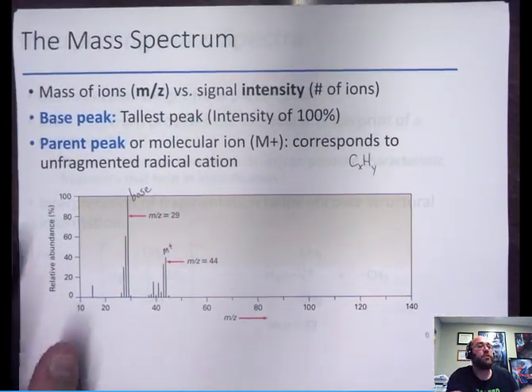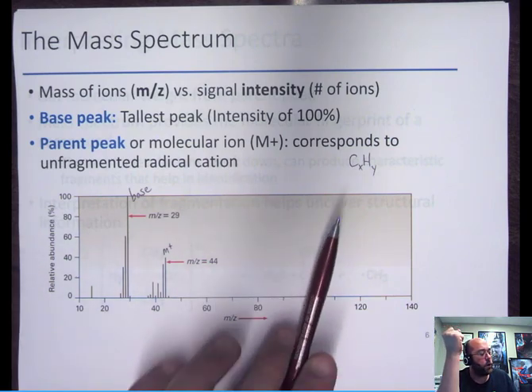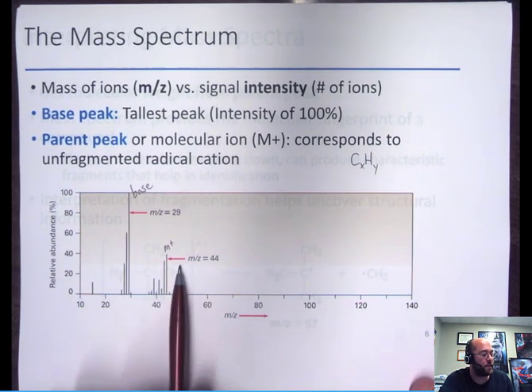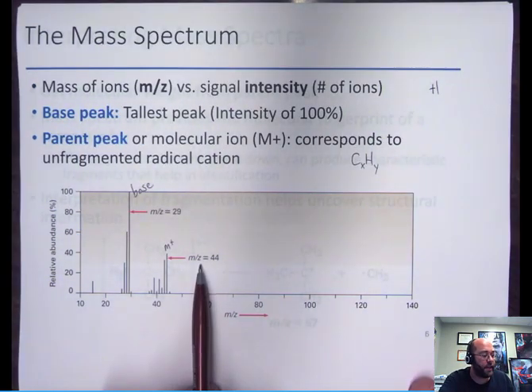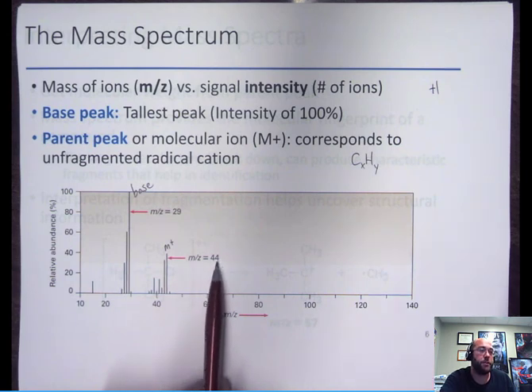Knowing this is only carbons and hydrogens, you can estimate the molecular formula, and from there maybe even hypothesize what the structure is. So what I would recommend is you look at the carbon and the hydrogen. This is a mass to charge ratio, and all of these charges are understood to be +1. So the Z here is always 1, so you're saying your mass divided by 1, which gives you just your mass.